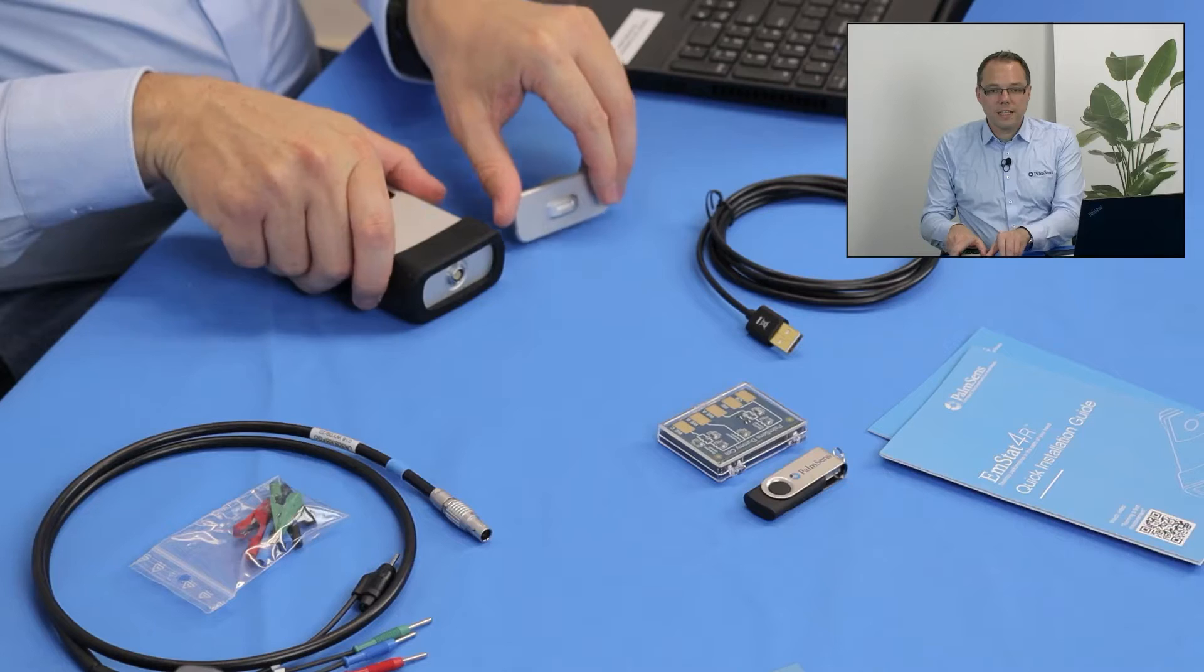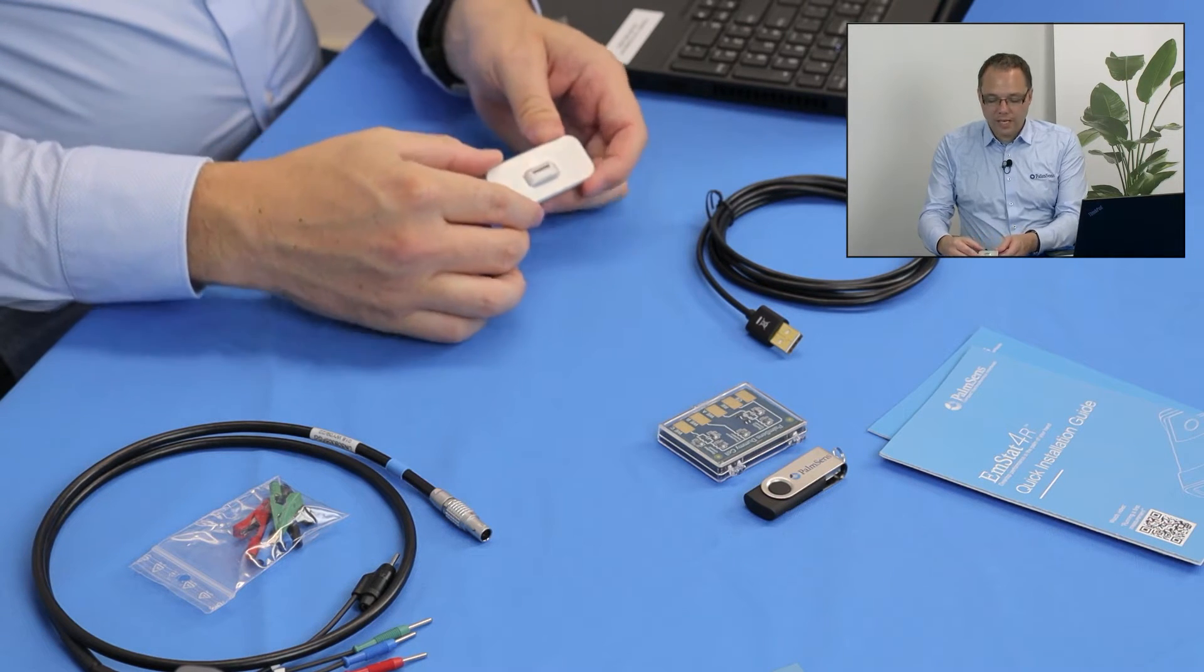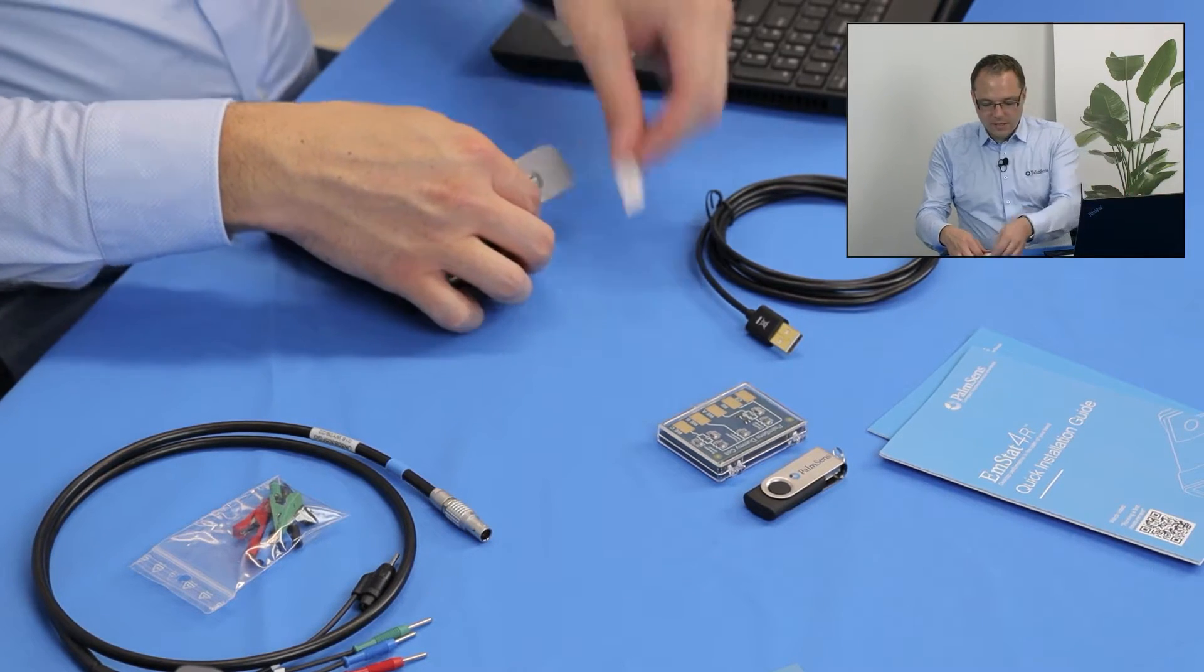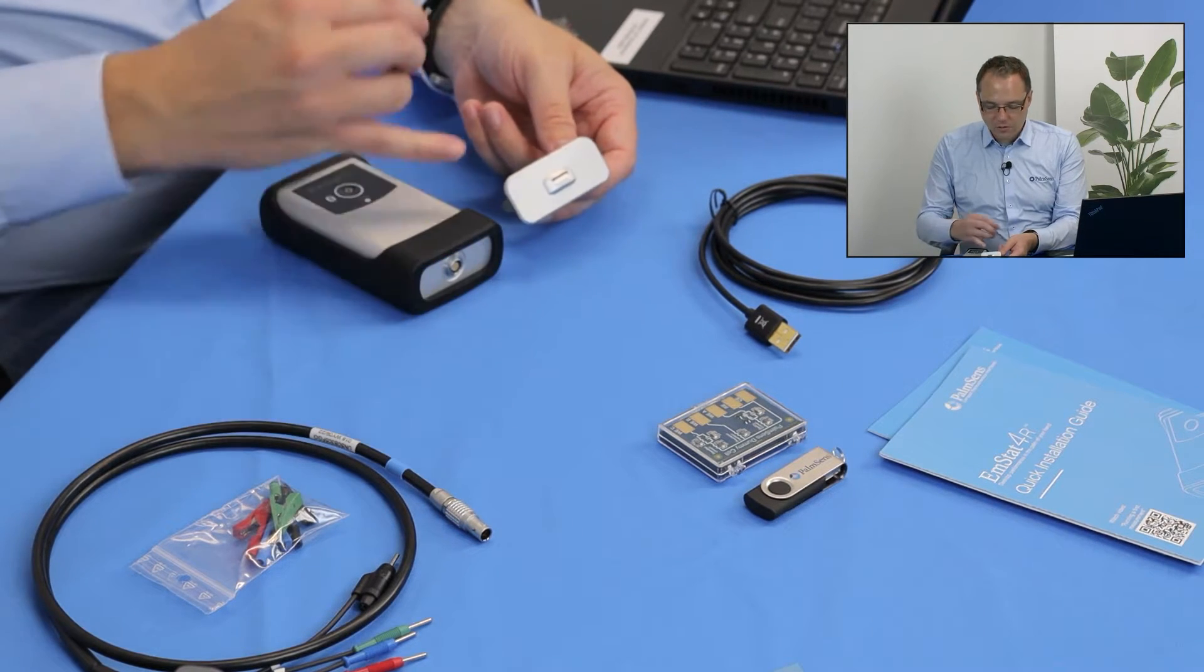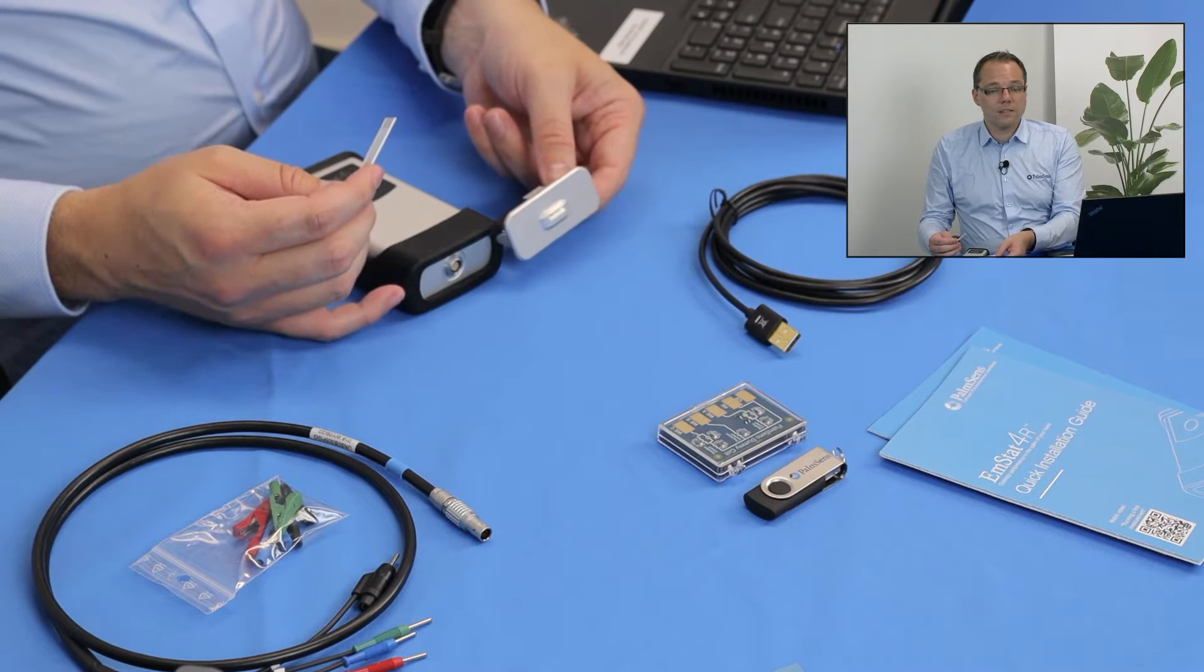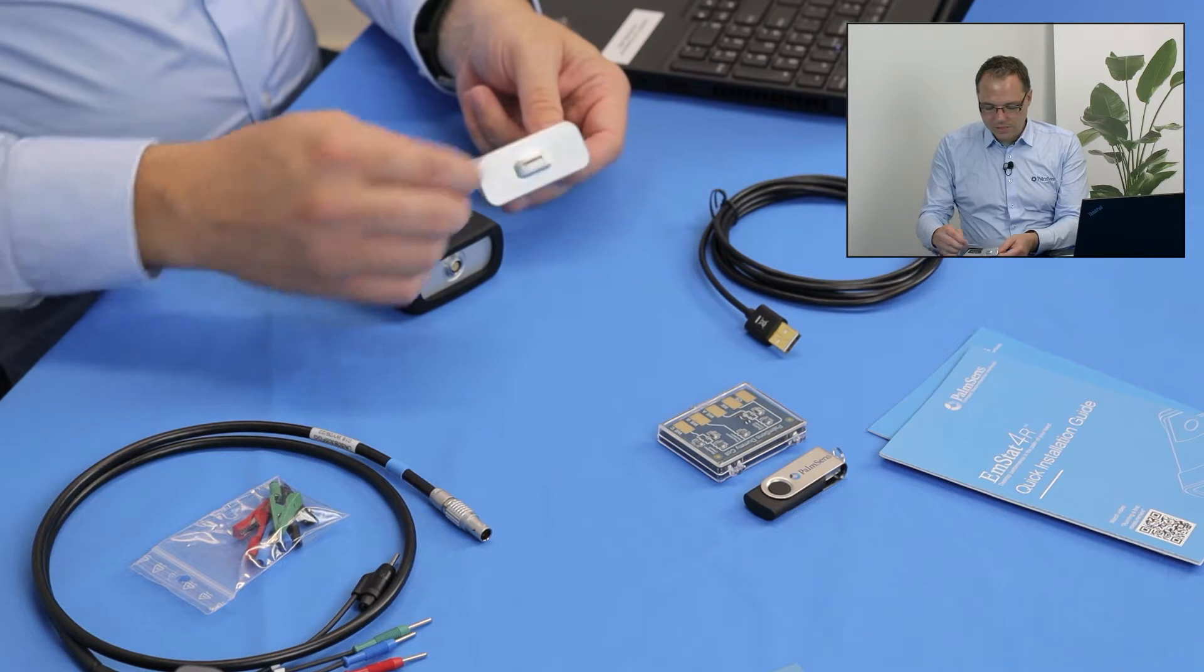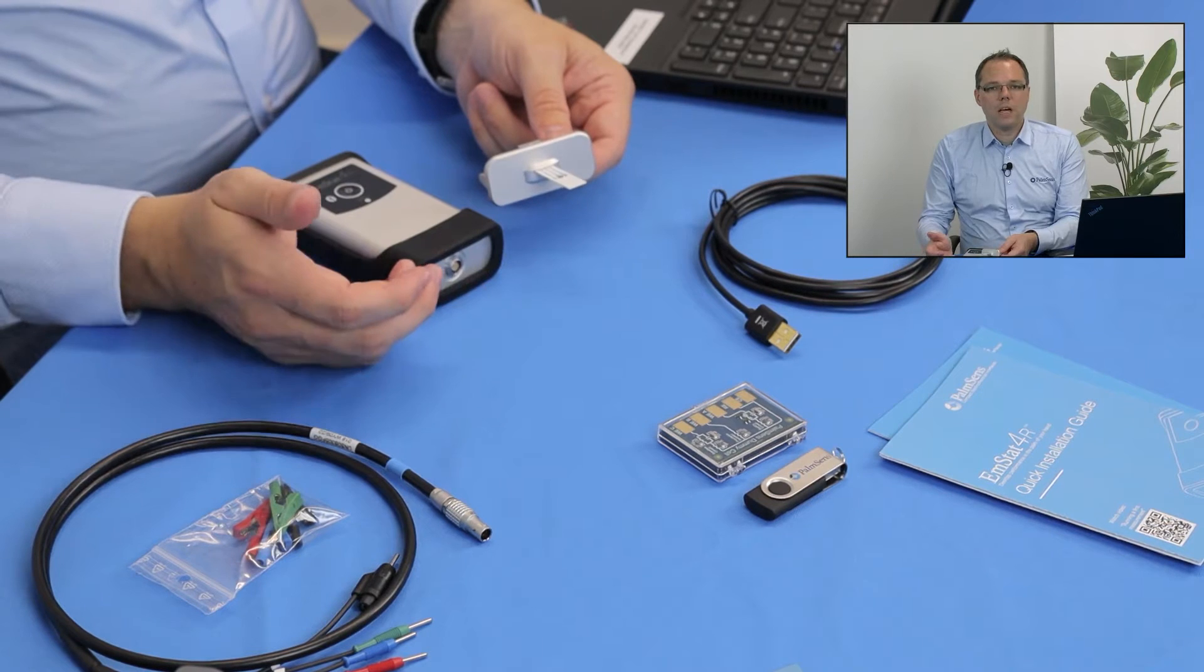So just before we start the measurement, I would like to show you an additional accessory you can get for the Emstat 4R. That is a front connector for screen printed electrodes like, for example, this one. When you want to use these type of electrodes, you can order this different front panel. You can even exchange the front panels yourself if you want to. And then you have in the front a connection for screen printed electrodes. You then just enter them into the instrument and there you go.